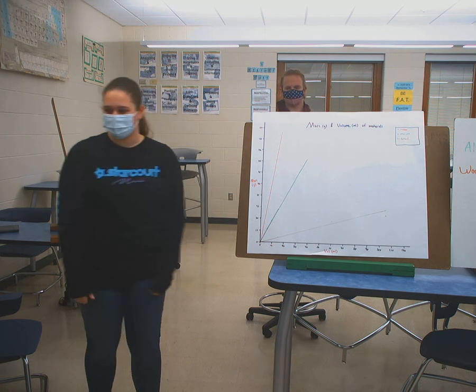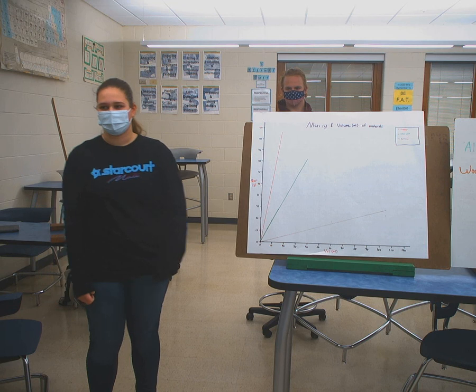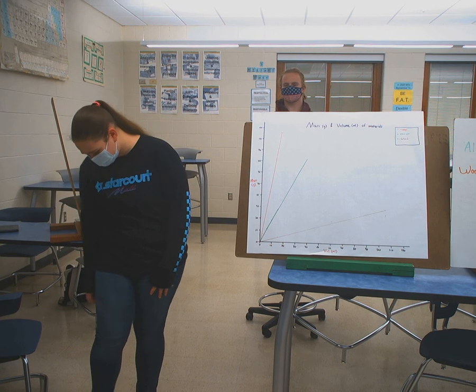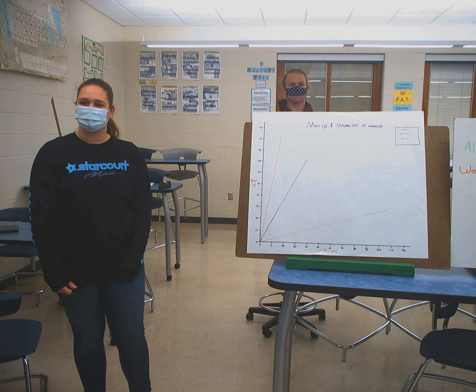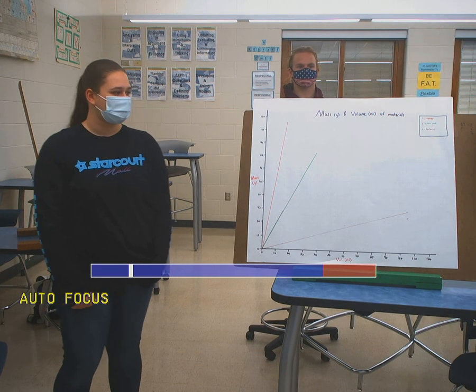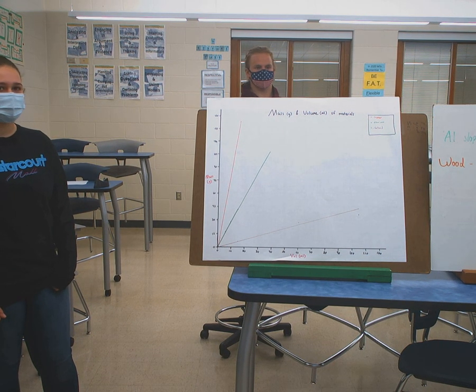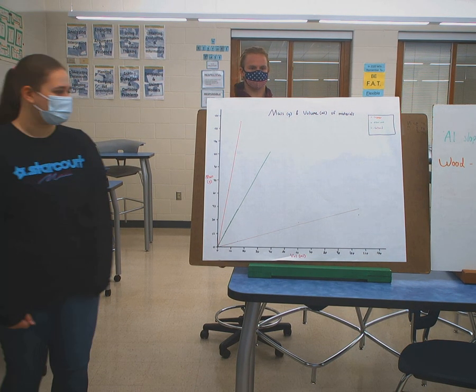Good. Now you could have just said very simply water displacement, but you did a good job trying to explain water displacement. All right. So this is your lab data, this is your data here, right, of 3 different materials. So how about you guys tell us about your board? How did the data show up? What do we got there?